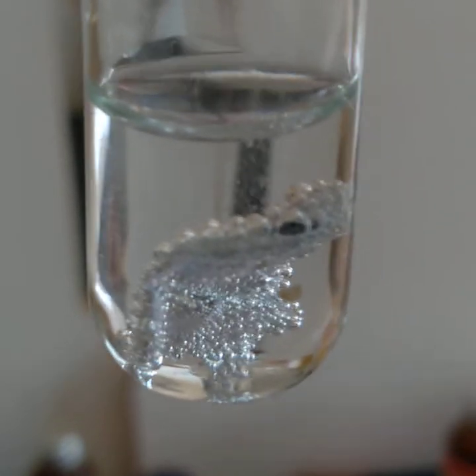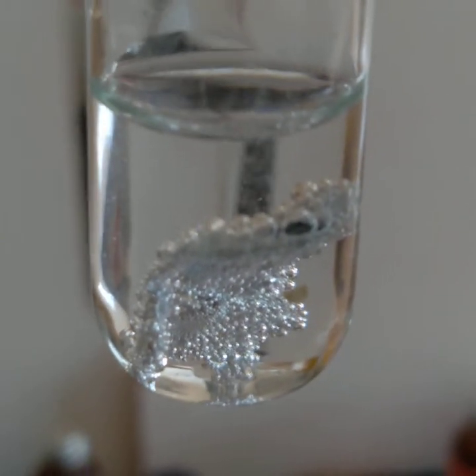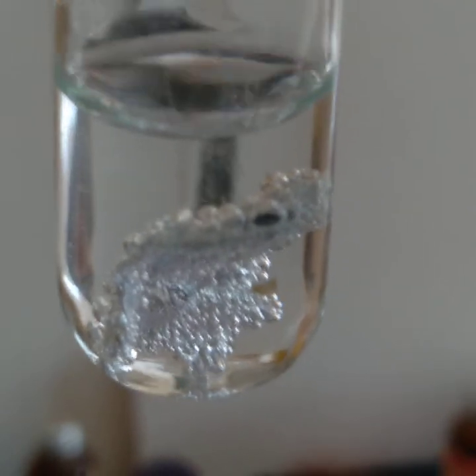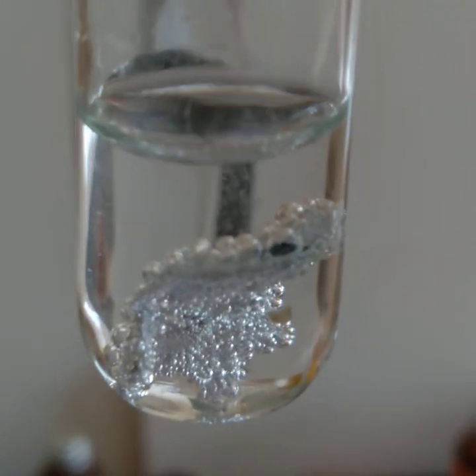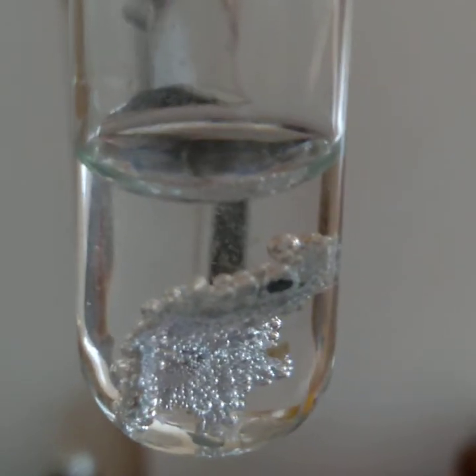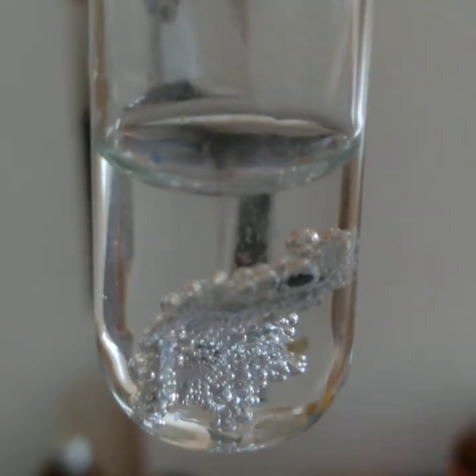Now look at the metal, it has completely changed because the reaction is taking place vigorously. Zinc reacts with dilute hydrochloric acid and is converted into zinc chloride and hydrogen. The bubbles which are coming out are due to the hydrogen. So this is the zinc metal test.